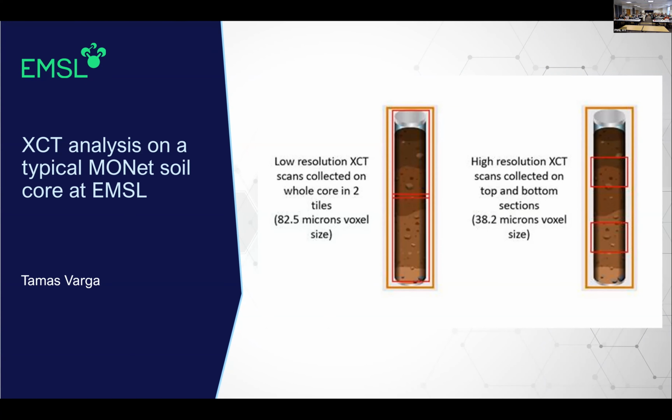When we went back, we saw that since the particulate organic matter is not decomposed in drought, this is shifting the pores. So there are a lot of things that particulate organic matter can change in terms of the pores that we are seeing. So is there a protocol in place to just exclude them? Well, if you can see them.